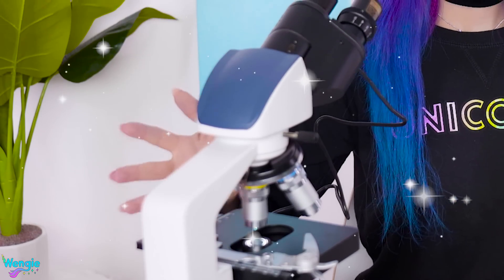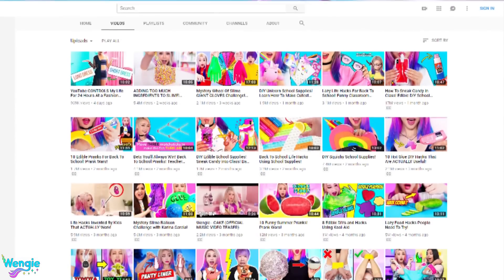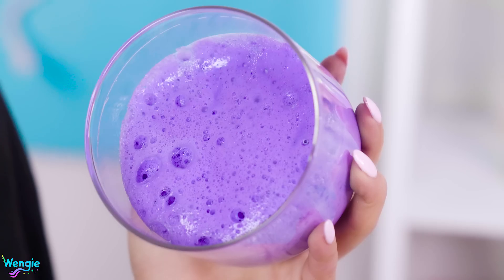Looks pretty sciency to me! Let's have a look at some slime under the microscope. First up we have some fluffy slime — this is the purple fluffy slime we made in our other video, adding too many ingredients into slime. We saved a bit of it. See how it's like really bubbly already? I'm kind of excited to see what it would look like. Probably disgusting. So let's pop some on our slide.